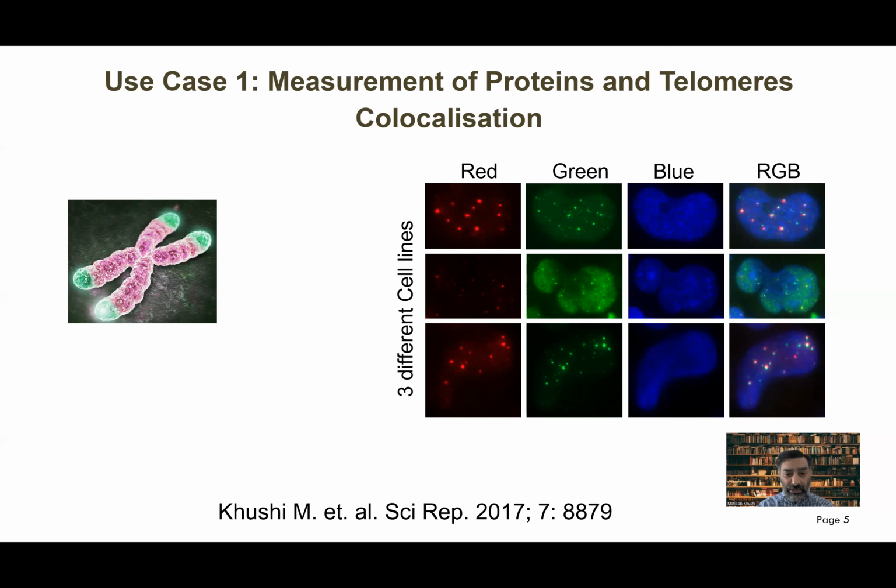These are some of the images that I took while I was working for the Children's Medical Research Institute in Australia. We were looking at the role of proteins and their co-localization with the telomeres. Now, what are telomeres? I know you will not know it. Telomeres are the end parts of the DNA. Looking at the left side of the screen, this is our chromosome, and the green parts at the ends are telomeres. They are not genes. And why are they very important?